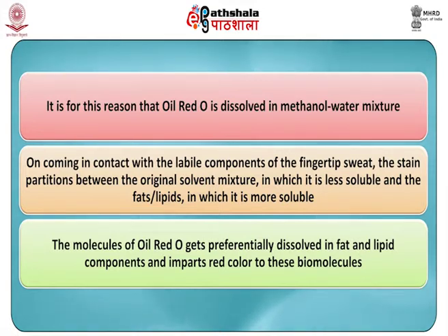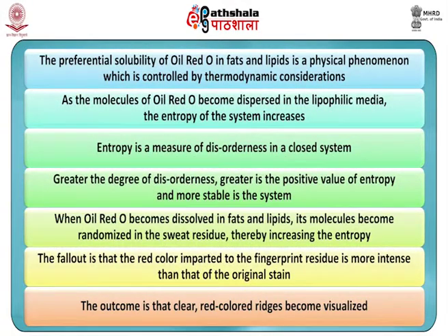The molecules of oil red O get preferentially dissolved in fat and lipid components and impart red color to these biomolecules. The preferential solubility of oil red O in fats and lipids is a physical phenomenon which is controlled by thermodynamic considerations. As the molecules of oil red O become dispersed in the lipophilic media, the entropy of the system increases.